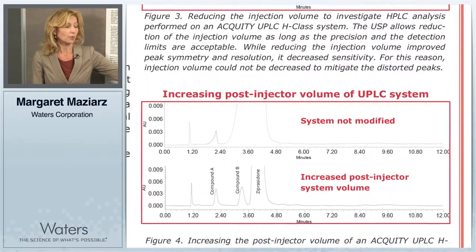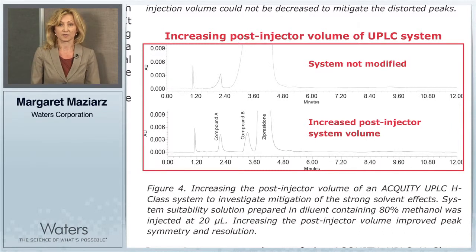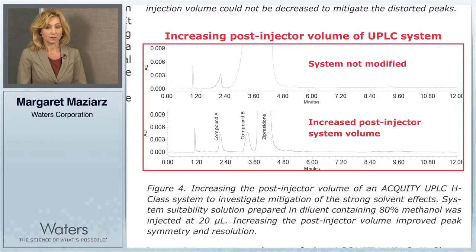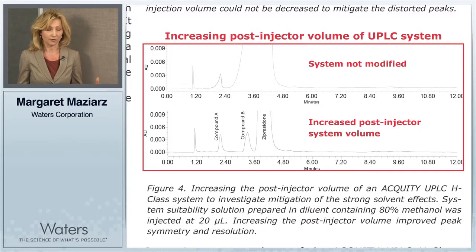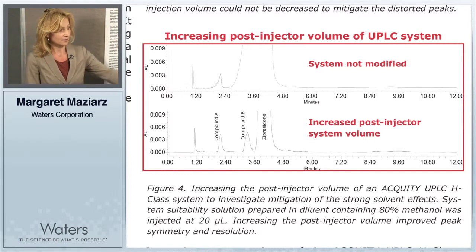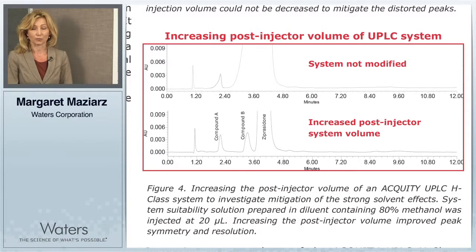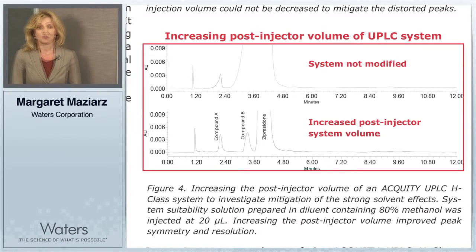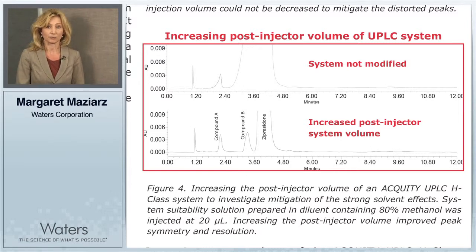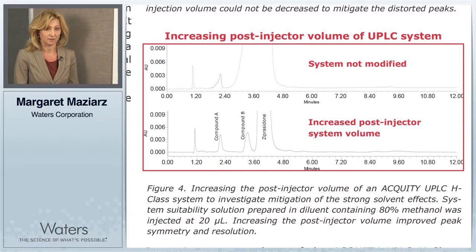In figure four, we increased the post-injector volume of the UPLC H-Class system, meaning we installed extra tubing between the injector and the column inlet to increase the system volume. That drastically and significantly improved the separation, peak symmetry, and resolution, and we remained within the allowable recommendations by the USP. By increasing the system volume, we were able to successfully reproduce the HPLC methods on the Acquity UPLC H-Class system.